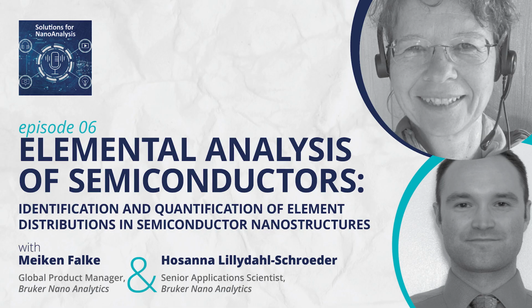Here I would like to mention a paper by Roland Pantel from ST Microelectronics. It was published in Ultramicroscopy, I think even 10 years ago now, and it describes the analysis of phosphorus and arsenic distribution using EDS, and we are speaking really of dopant-level distribution. In that work, one single EDS detector with a light element window was compared to 4 windowless detectors arranged in an annular geometry around the pole piece of one very similar microscope. They were compared concerning their performance in dopant analysis. I think we need to discuss this high collection angle annular geometry later on during our little podcast.